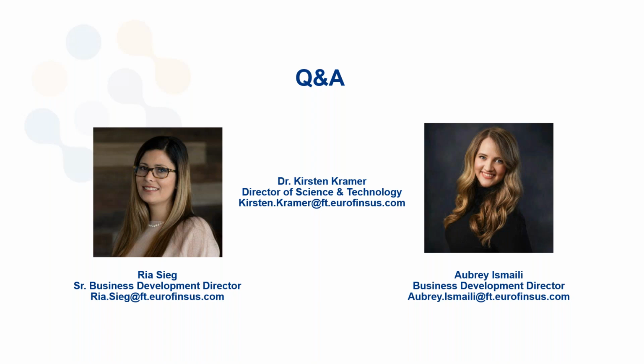I can field that one. It will vary from material to material. And oftentimes we already have a calibration built that contains hundreds or even thousands of samples and is really well-founded, built up over several years of data. But typically 20 samples are required for a feasibility study just to see if IR can do it. And then we suggest maybe 50 to 100 to really get that calibration model strong and reliable.